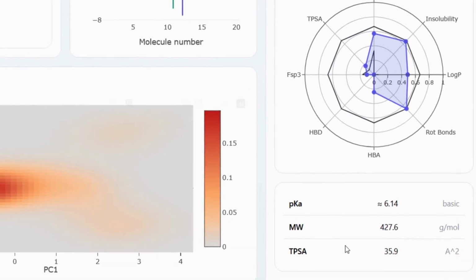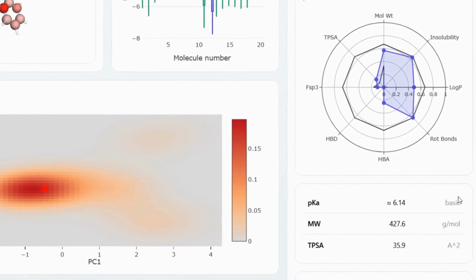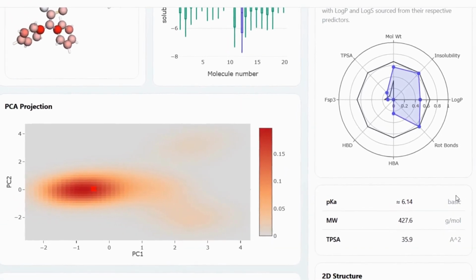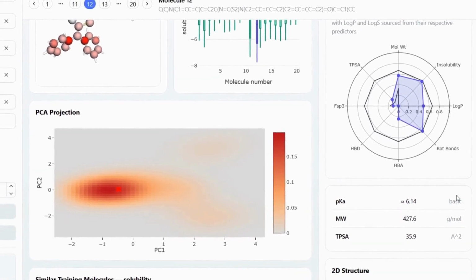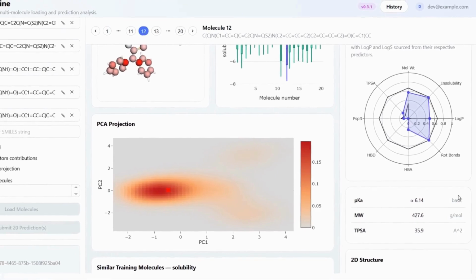We can also predict at what pH the molecule will become charged, this balance point known as pKa, shown right here. This is crucial both in laboratory settings, in planning reactions and purifications, and in predicting the behavior of the molecule as it goes into the first acidic stomach and then into the basic intestine.